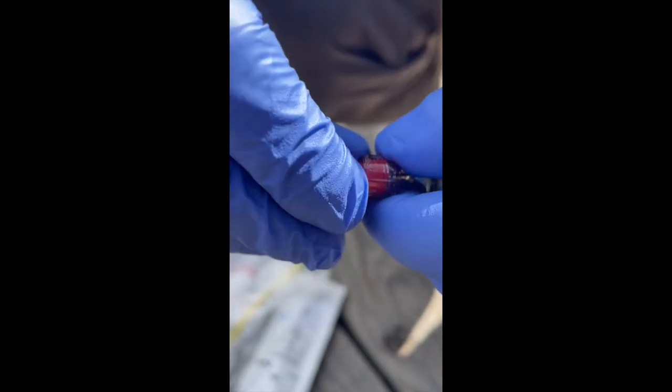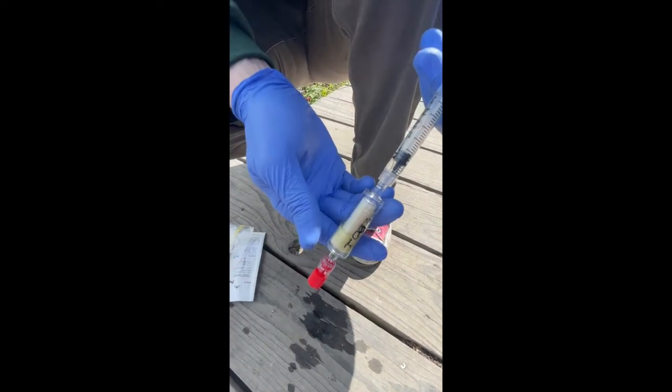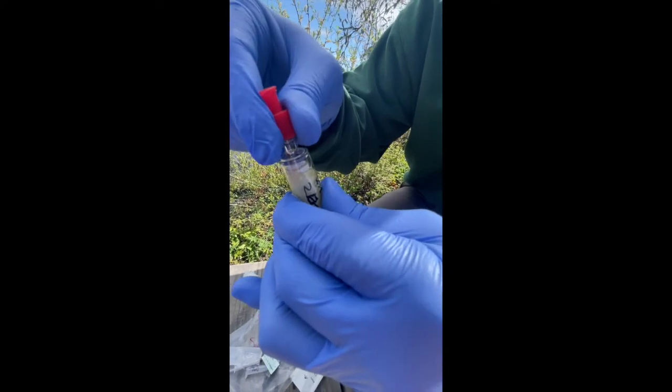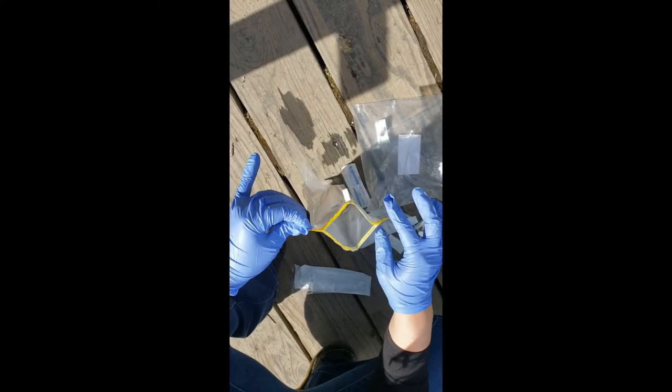Seal the filter with the luer lock caps on the bottom and on the top, then take the filter and put it into the provided Whirlpack bag.